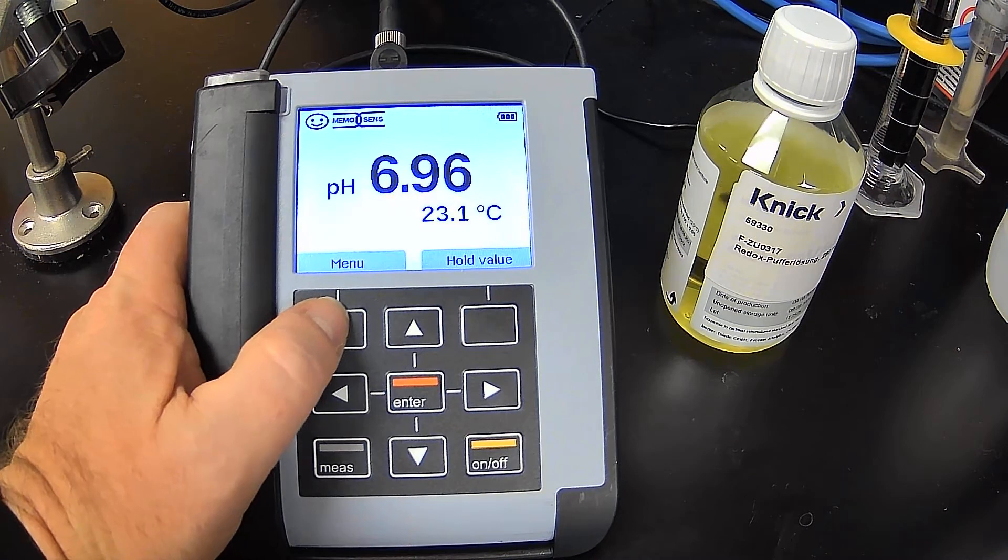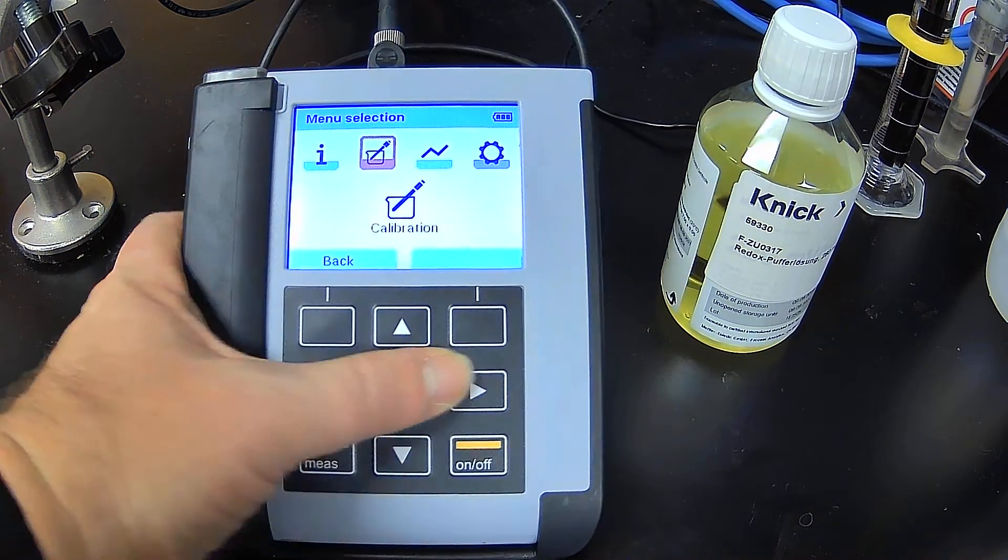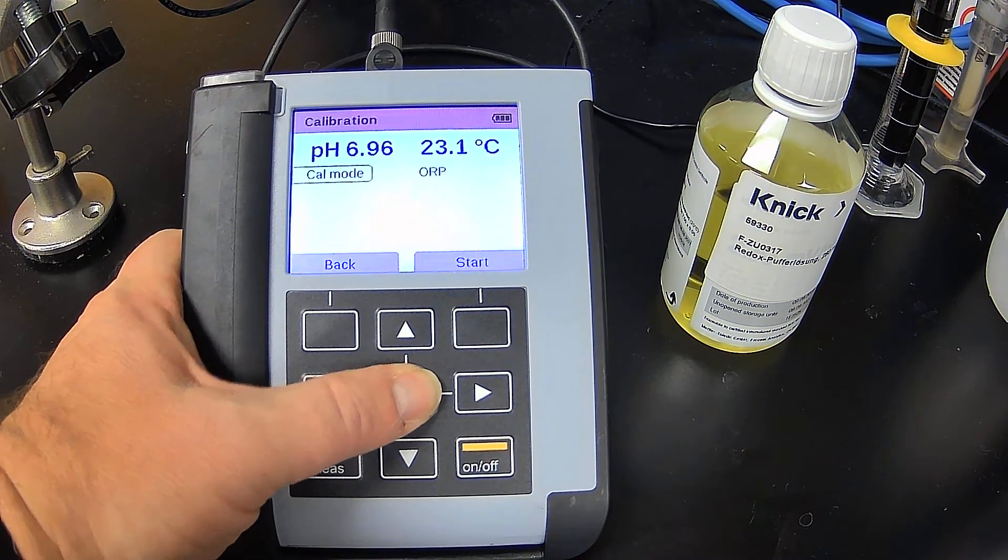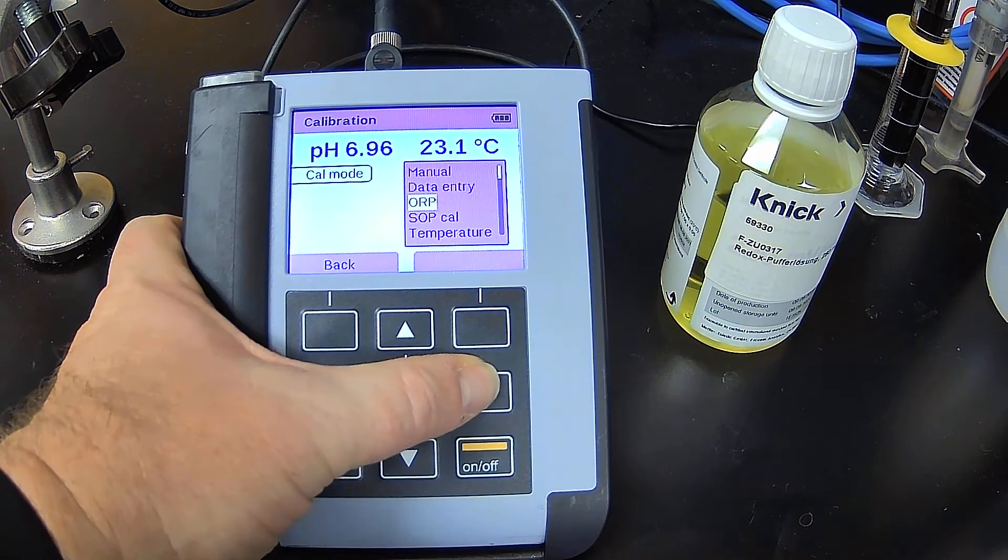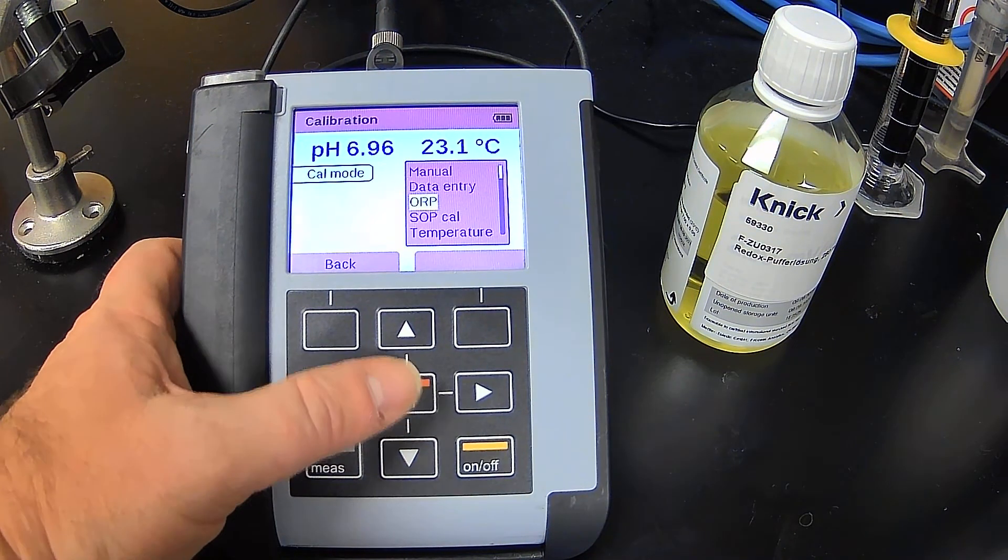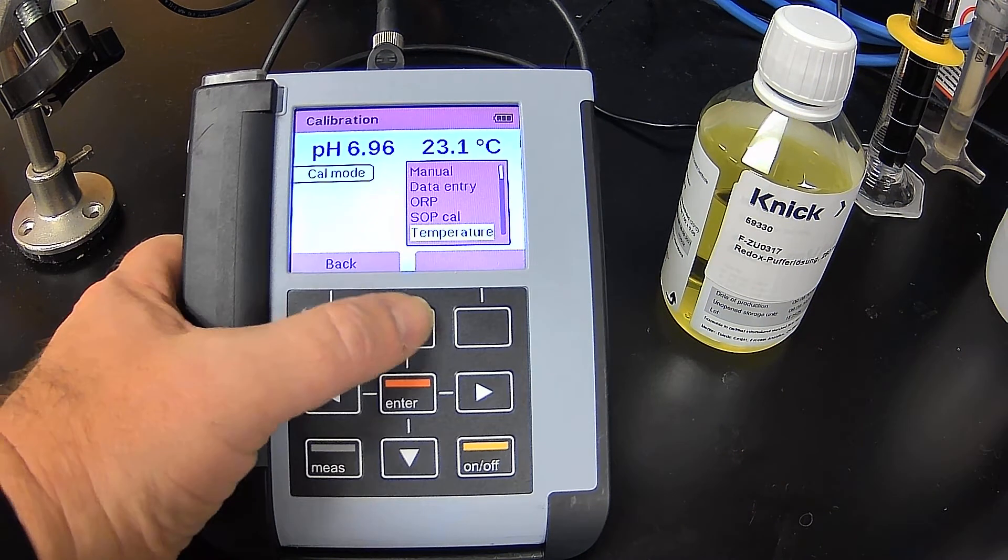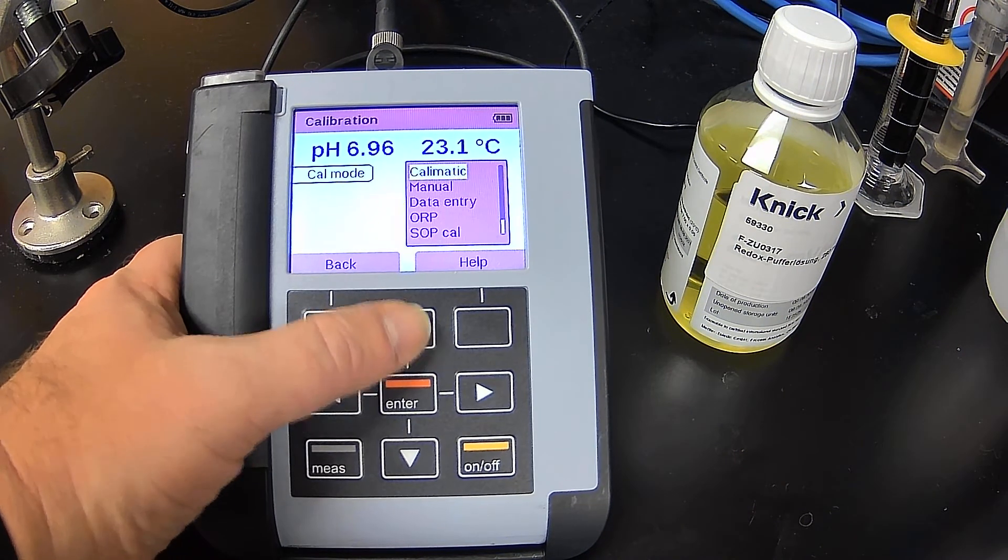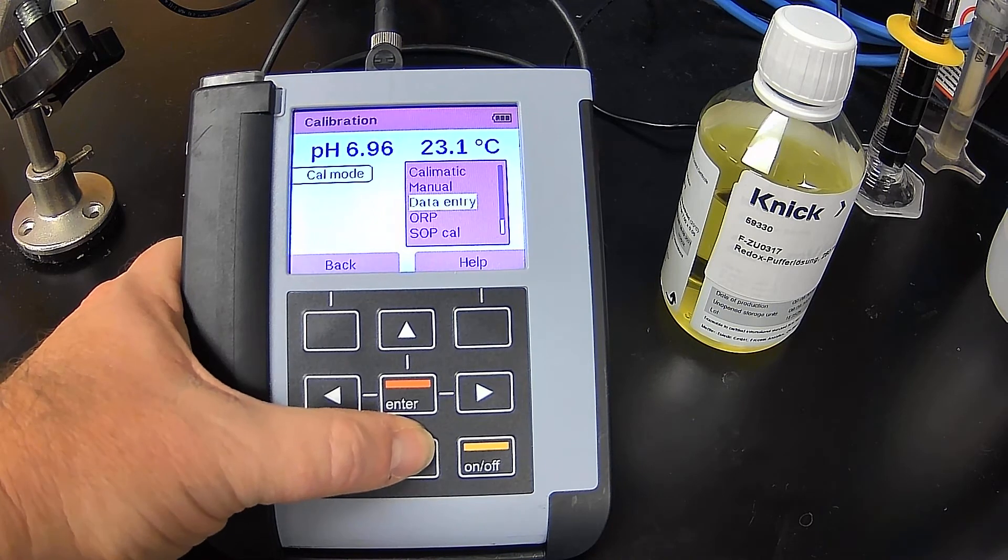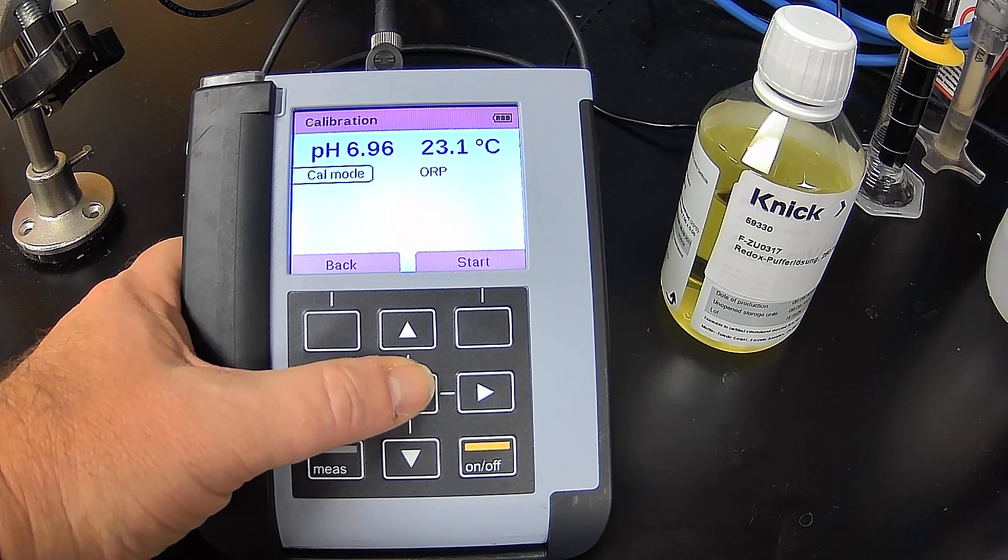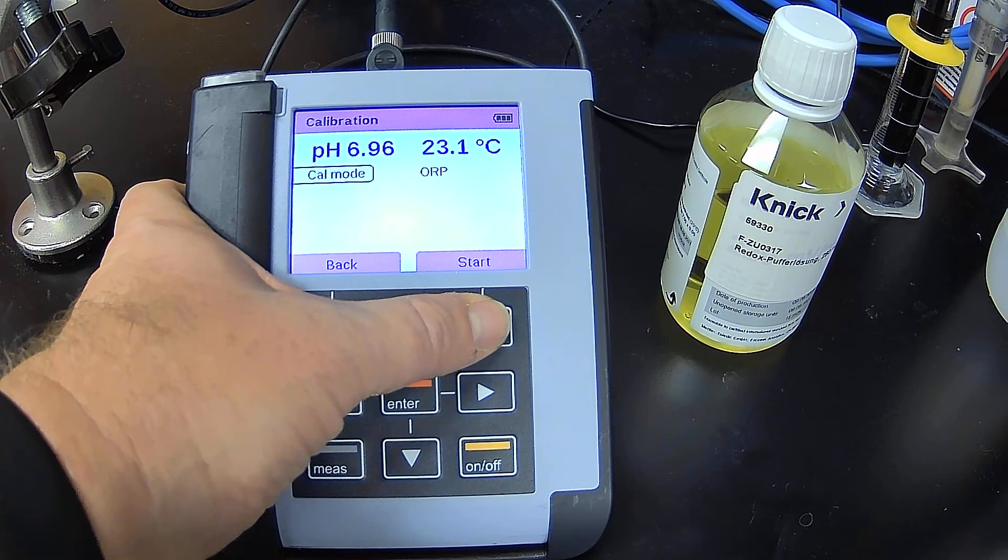So let's go ahead and hit menu, calibration. Now here we select how do we want to calibrate. So right now we're going to do ORP. Okay. So I hit enter. I hit start.